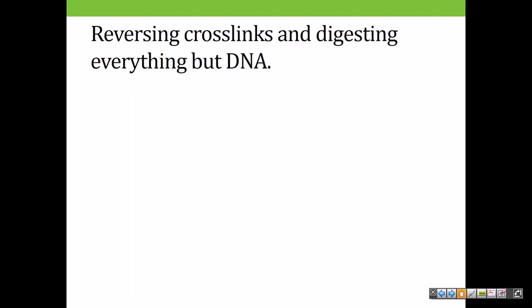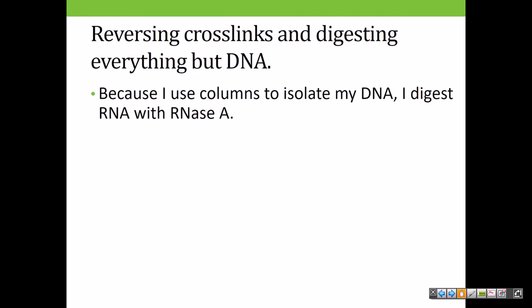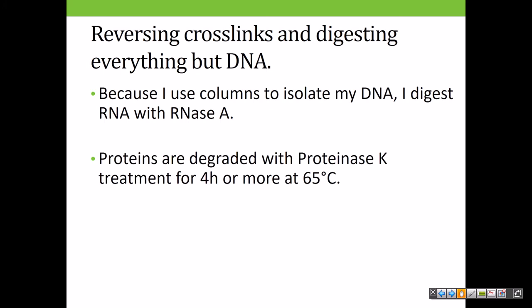Okay, so we need to reverse the cross-links because we want to release our DNA and digest everything but the DNA. Because I use columns to isolate my DNA, I do digest the RNA with RNase. If you're using phenol chloroform extraction, that by its own process will separate the RNA from the DNA, so you don't have to do this step if you're not using columns. I find that if you use a column, you need to do this step, but it's pretty fast. It's about 30 minutes at room temperature.